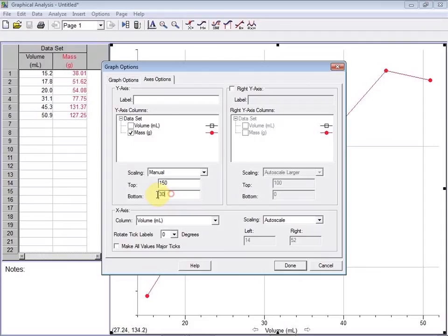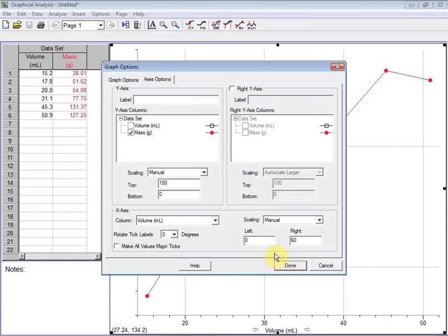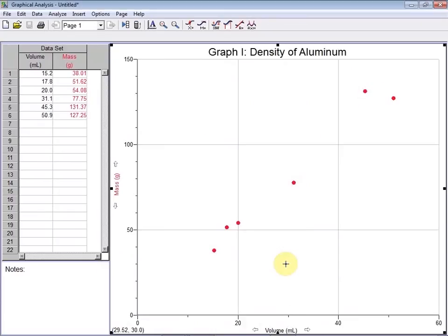We'll go ahead and scale our y-axis mass from 150 to 0. And down here, our x-axis, we'll go ahead and scale from 0 to 60. We got rid of connecting the dots, and we zoomed out our graph to the range that we selected.